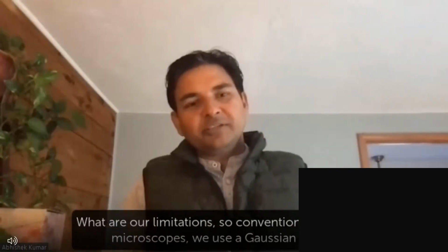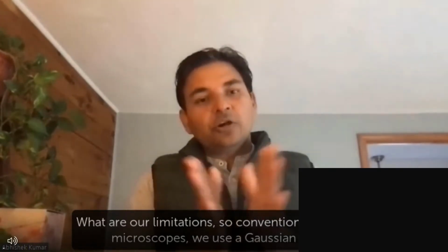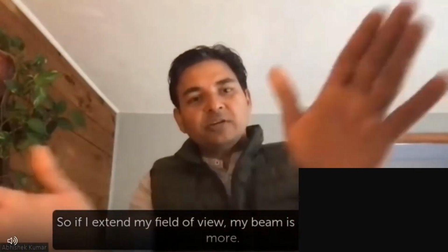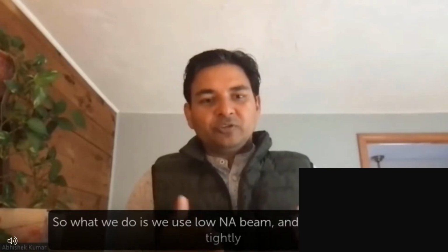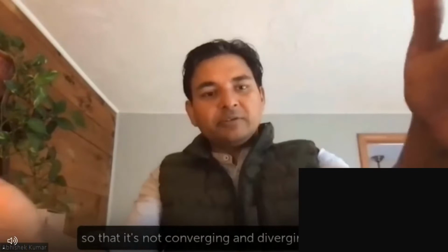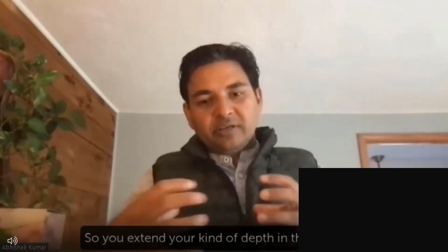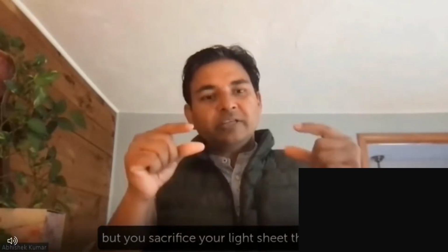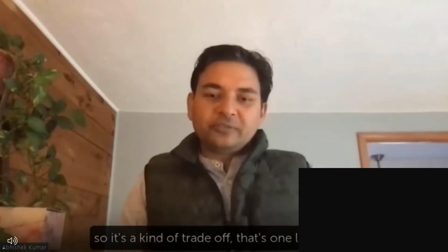Yeah. What are our limitations? So in conventional light sheet microscopes, we use a Gaussian beam. If I extend my field of view, my beam is going to diverge more. So what we do is we use a low NA beam, and we don't focus it tightly so that it's not converging and diverging very fast. So you extend your depth in that respect, but you sacrifice your light sheet thickness. So it's a kind of trade-off.